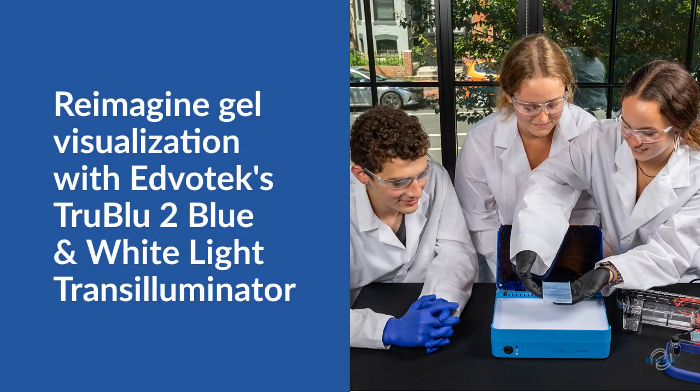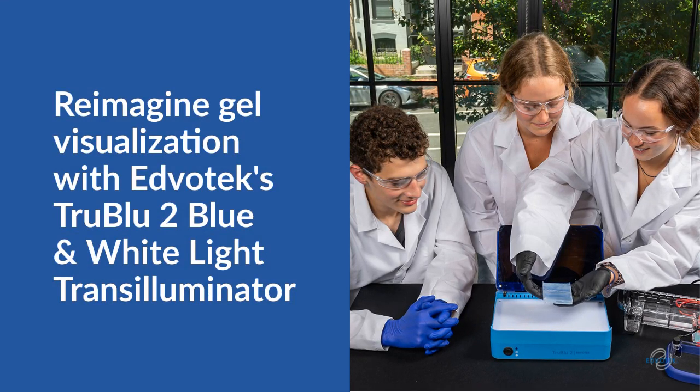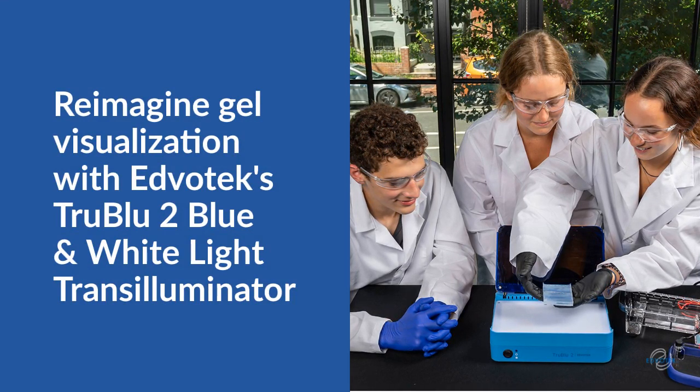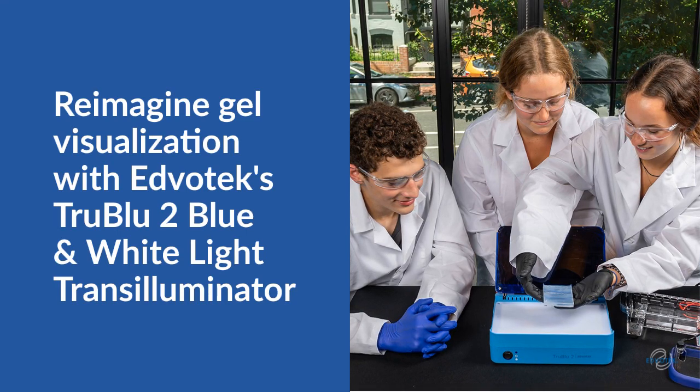Edvotech brought electrophoresis into the classroom with our high-quality, student-friendly chambers and power supplies. To simplify gel visualization, we developed the Edvotech True Blue 2 Transilluminator — the ultimate tool for visualizing DNA, RNA, protein, and dye samples.